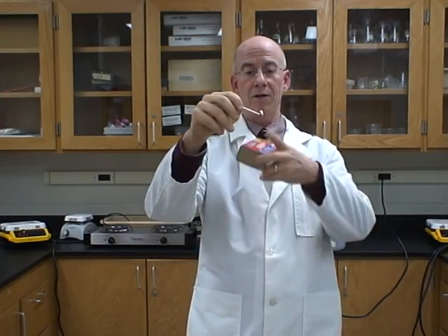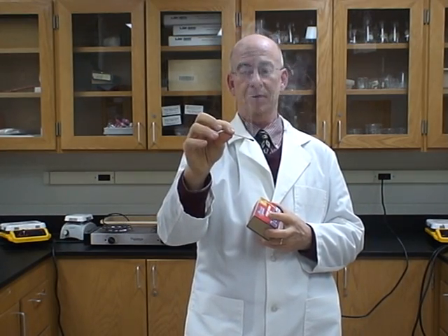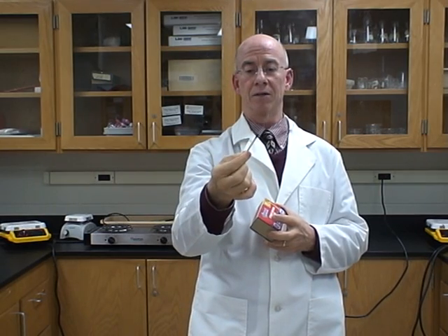The next example is we're going to take a match. Okay, I'm simply going to light the match. And here we go. You can see smoke there, yellow color. It was red, now it's black. Let's put it out. Again, lots of smoke. And a black ashy color.